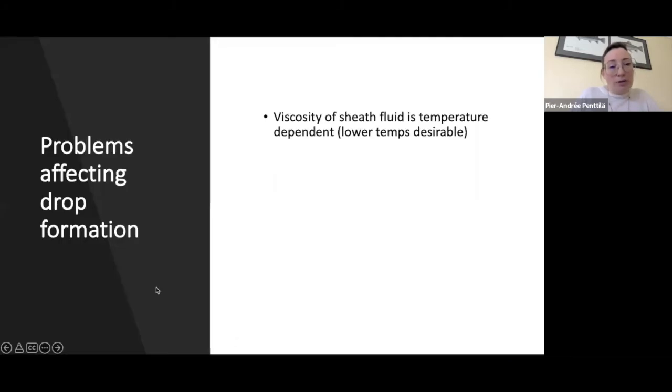So now I will briefly discuss some of the factors or problems that would affect drop formation in a typical cell sorter. The first is actually temperature. The viscosity of the sheath fluid is temperature dependent, and this is why lower temperatures are always desirable.